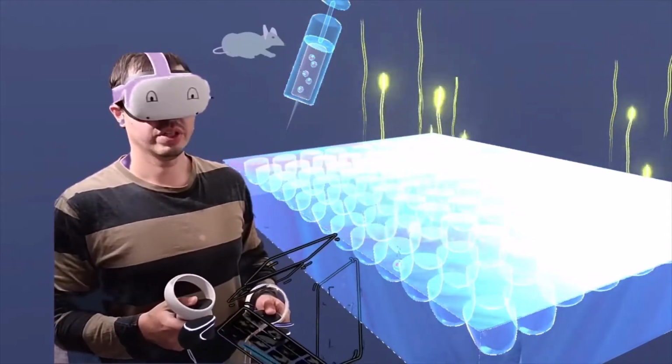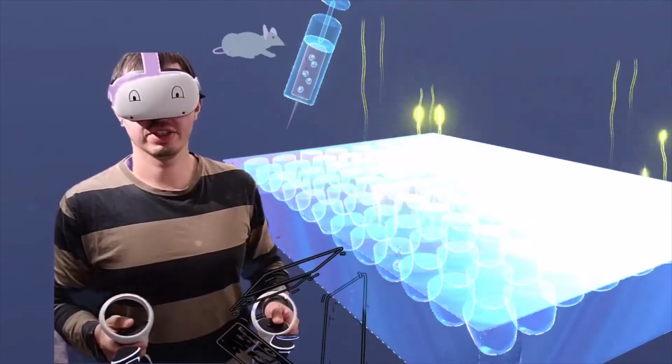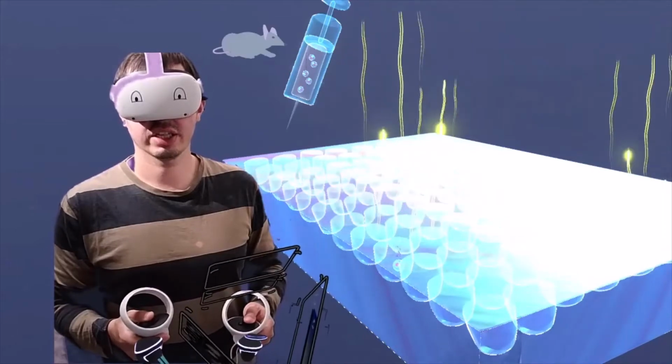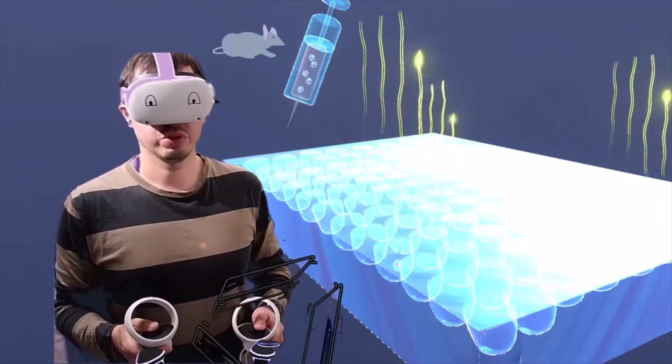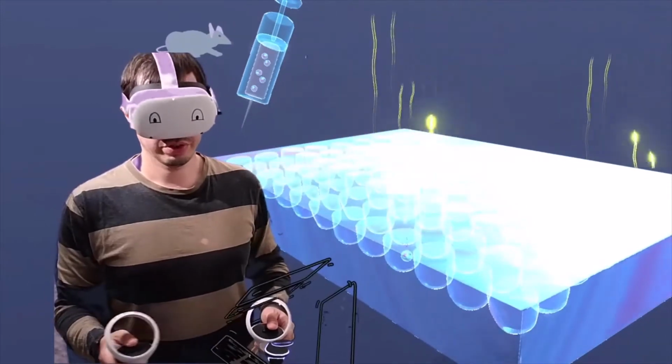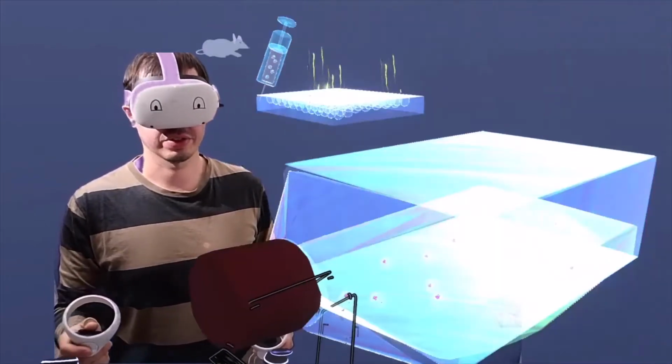What I need to do is to pull out the information. So I need to expand these cells, take out the genes that encode my protein, and then we'll see what to do with them. So first of all, how do I expand my cells?